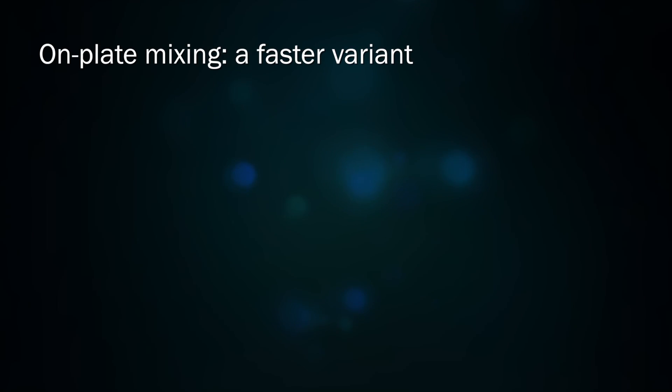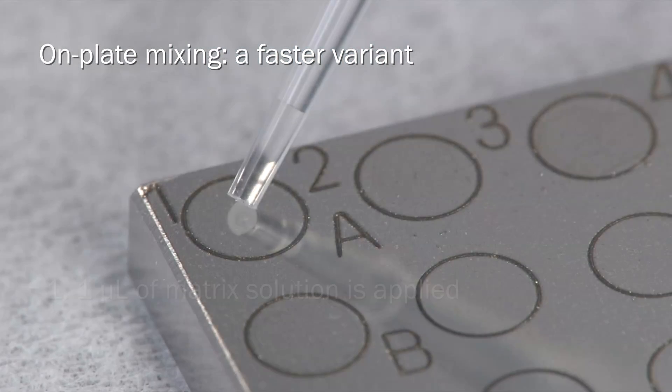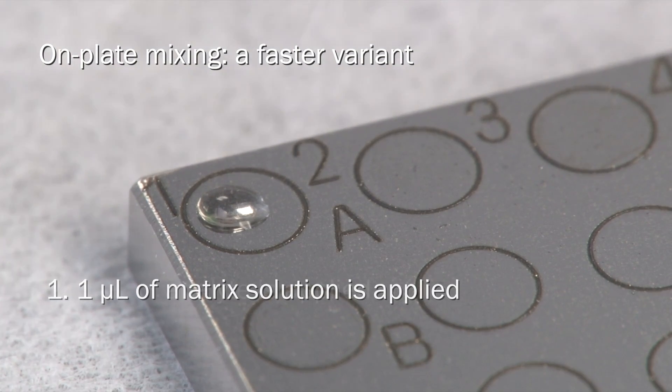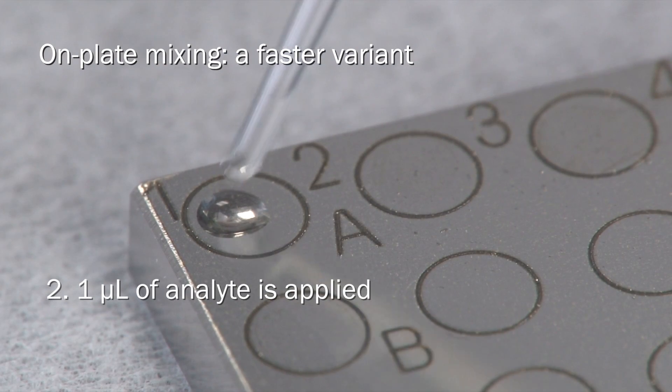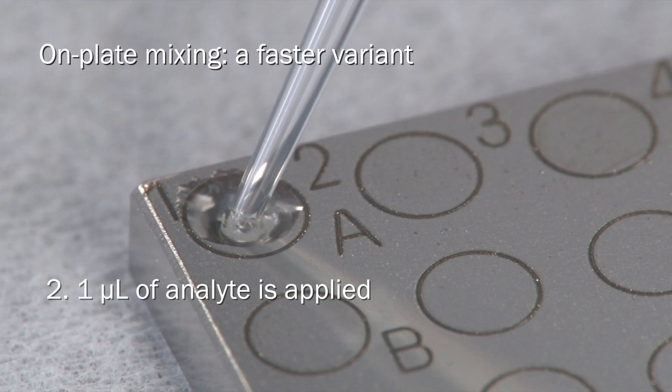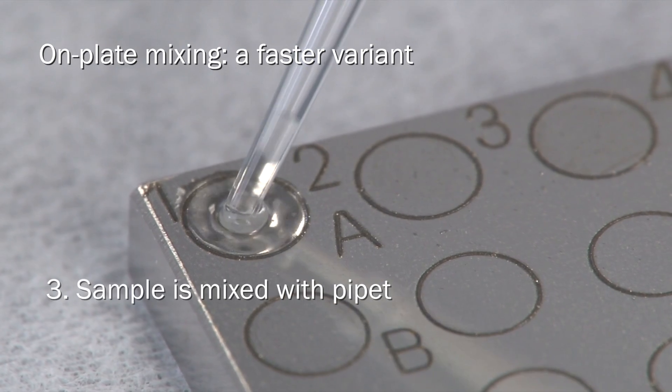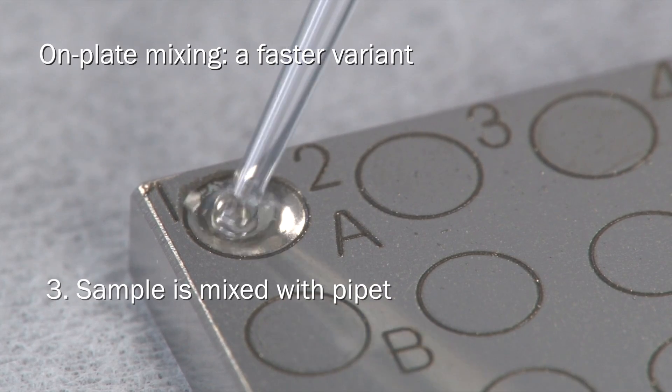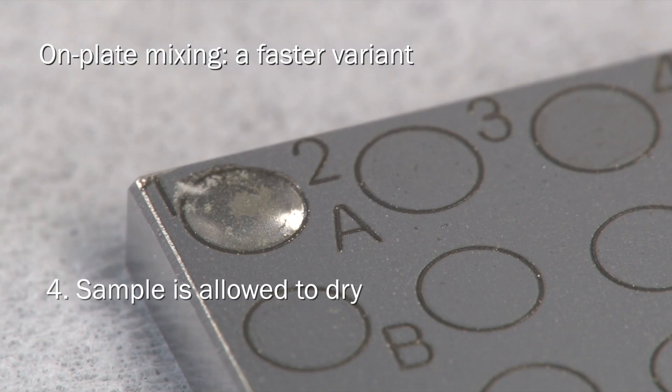A faster variant of the dried droplet method is on-plate mixing. A 1 µL droplet of the matrix solution is applied to the target, and before it dries, 1 µL of the analyte solution is added into the matrix droplet. The solutions are mixed by repeatedly withdrawing and expelling with the pipette tip. The sample spot is then allowed to dry.